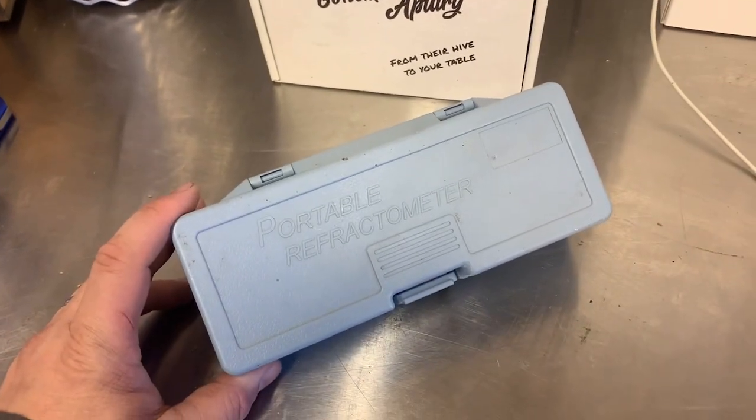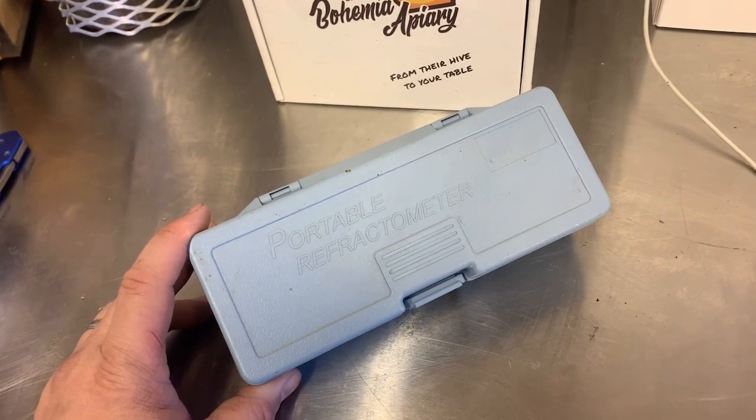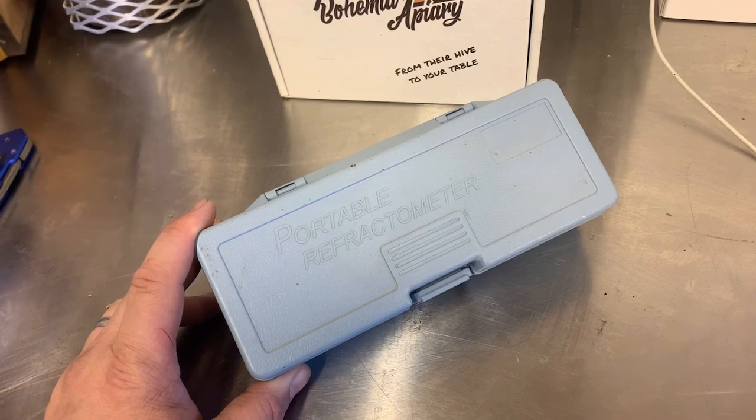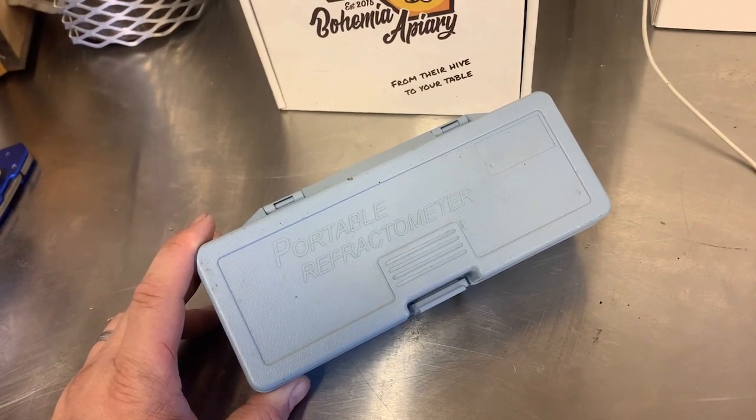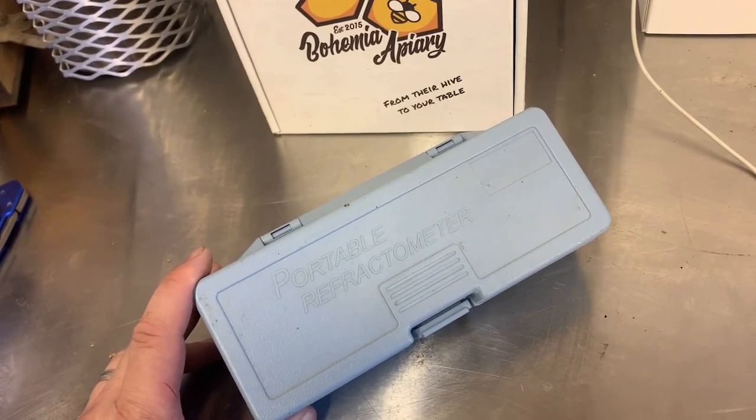This little tool is called a refractometer, and what a refractometer does is it uses light and pushes it through the substance, whether it be water or oil or honey.